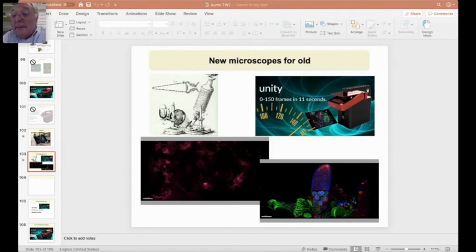So we have one more question here. Is it possible to identify who actually built the first scanning microscope with galvo mirrors? Whew. I don't know that. I can identify that we built things with galvo mirrors that didn't work, but that probably isn't it. Fred Brackenhoff?